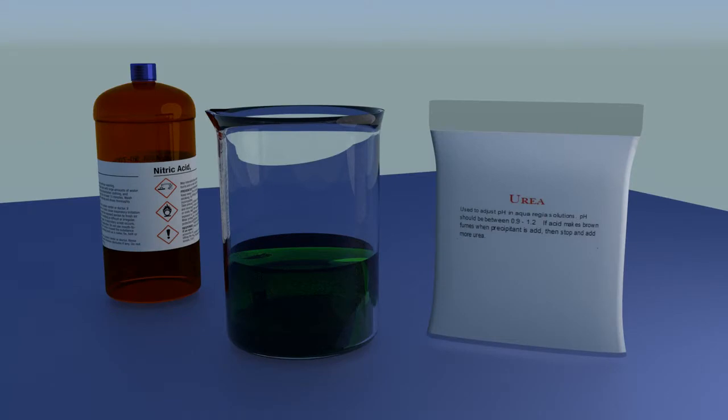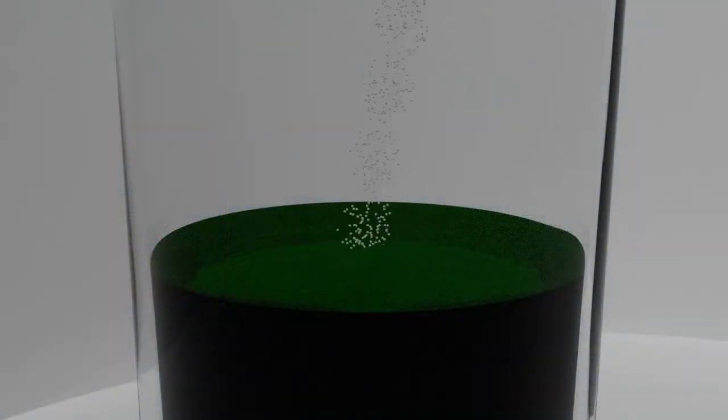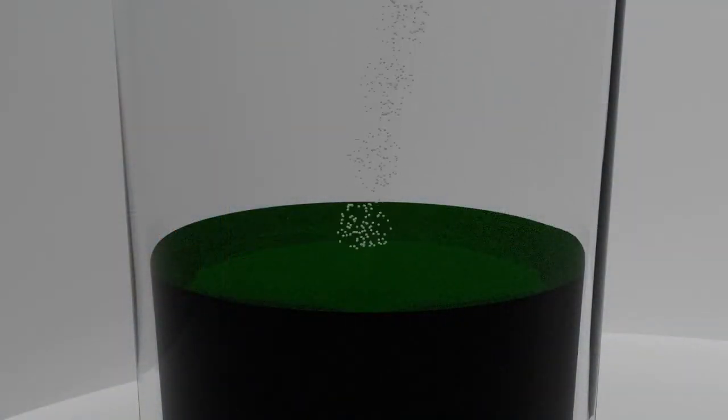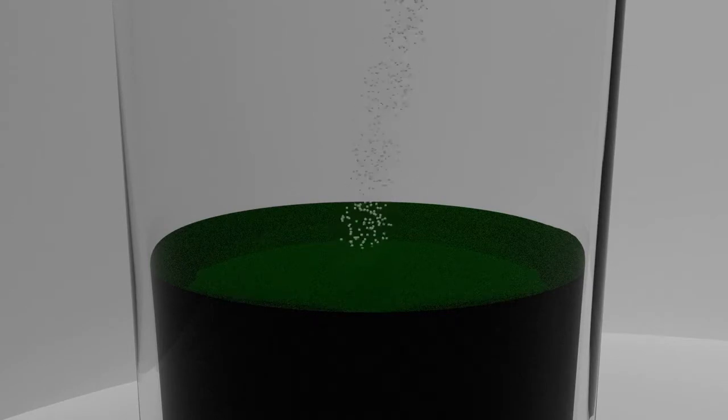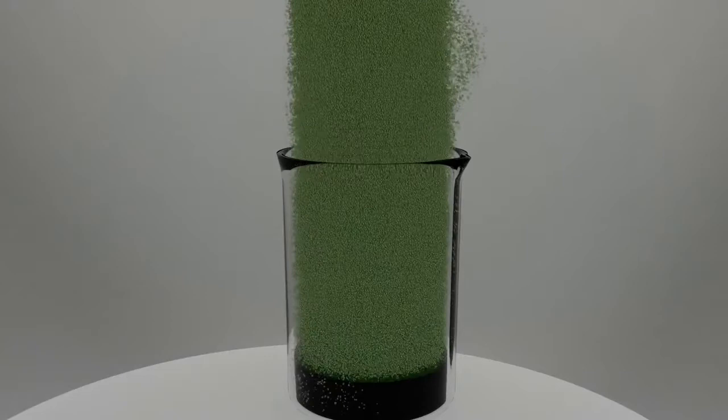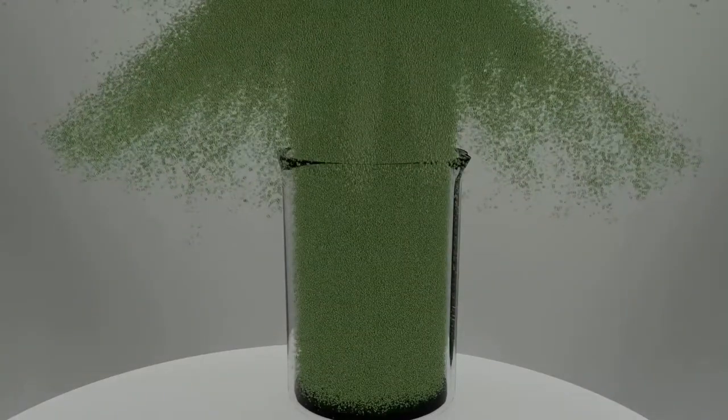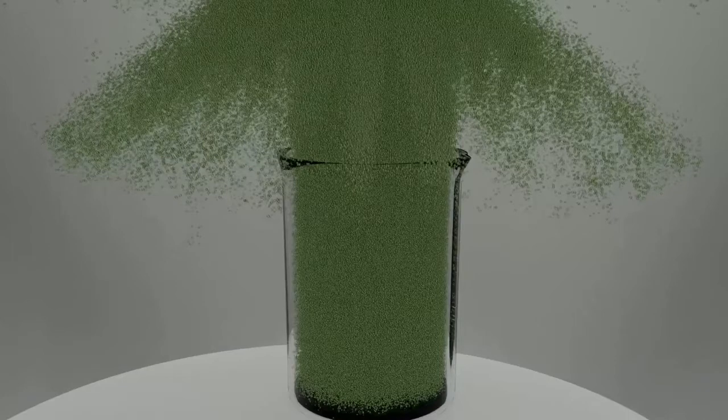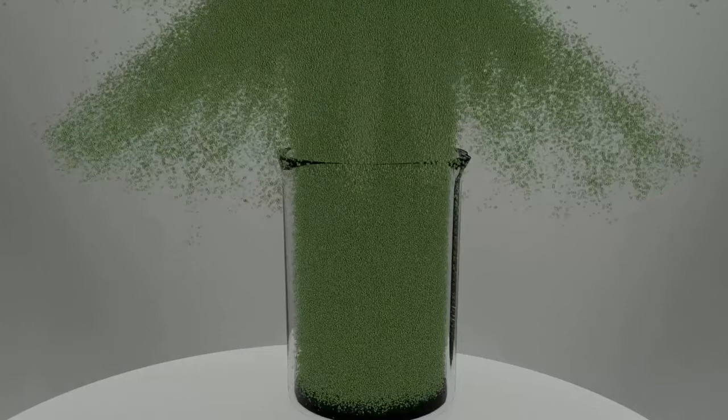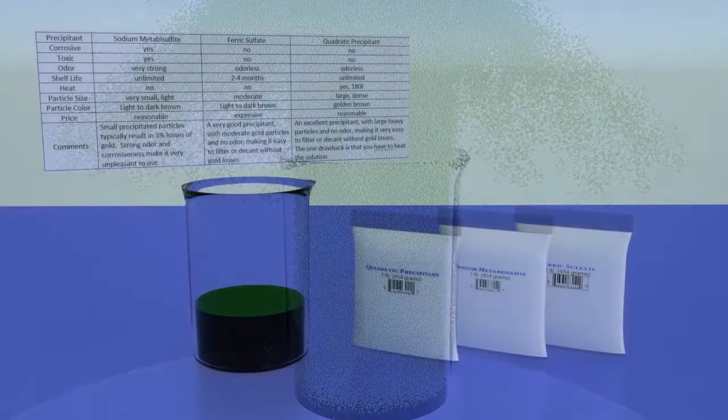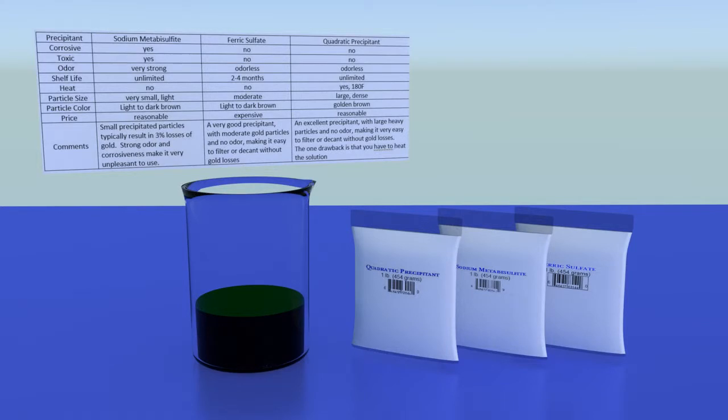Whether working with sodium nitrate, MX3 concentrate, or nitric acid, when the urea stops fizzing, it means that you are done adding it. If working with nitric acid, it is typical that a lot of urea is required. If adding a lot of urea, add it slowly. Though uncommon, sometimes if adding quickly the urea reacts violently with the acid. While that kind of reaction is highly unlikely, adding urea while your beaker is in a bucket is a good idea. Better safe than sorry.